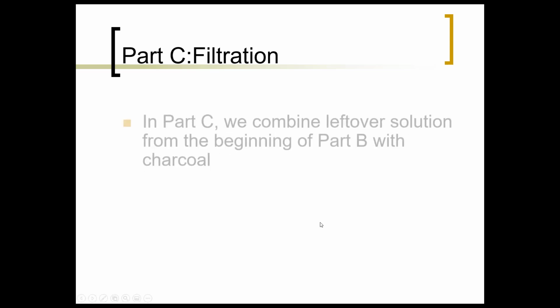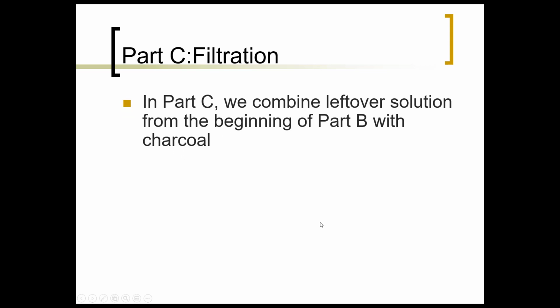Welcome back to the last video for Experiment 10 on Part C. Part C relies on the same solutes and testing that we used in the previous part with a small twist. So now, in addition to the three solutes, sodium chloride, glucose, and starch, charcoal will be added to the solution.